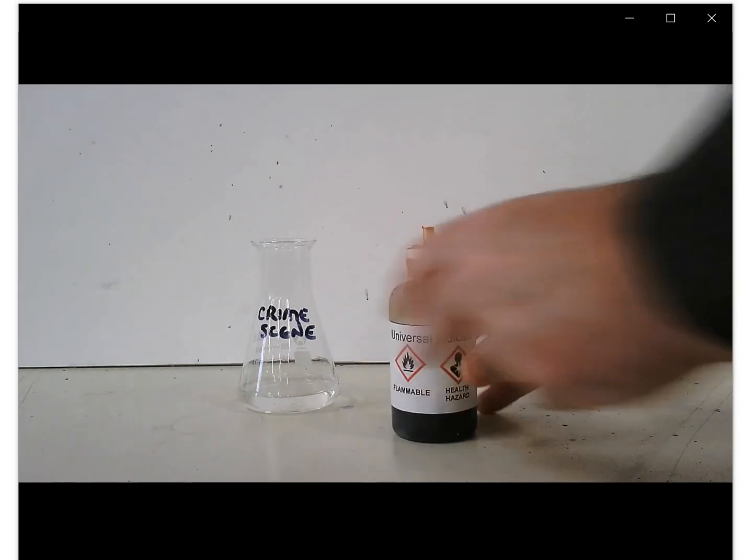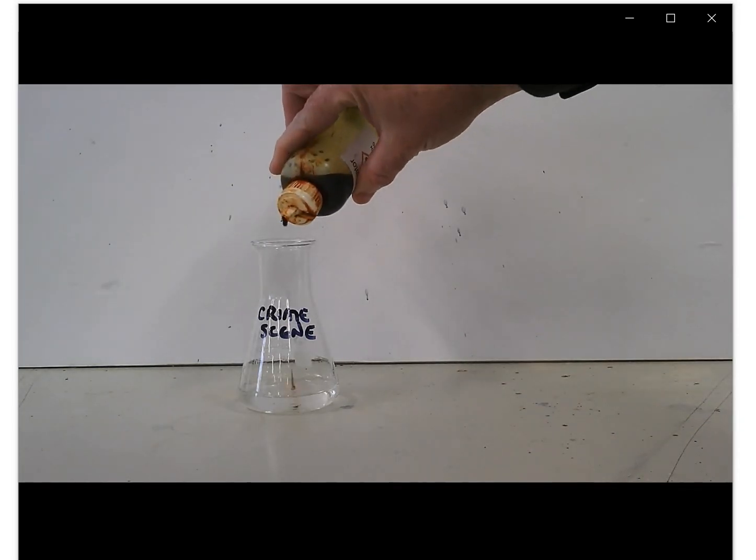We're going to add plenty of universal indicator so we get a nice strong colour to make it easy to identify.